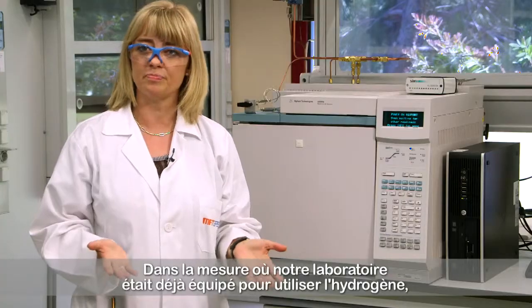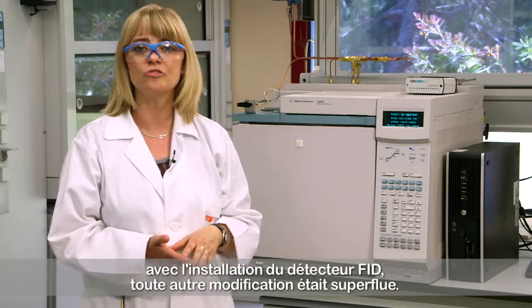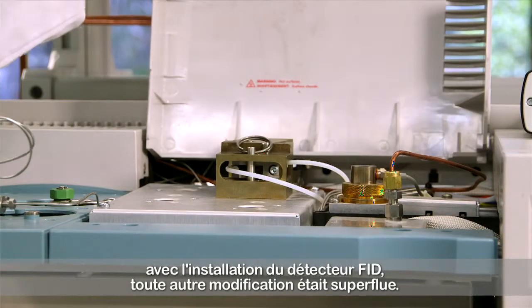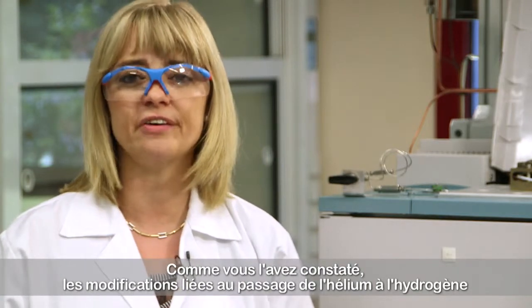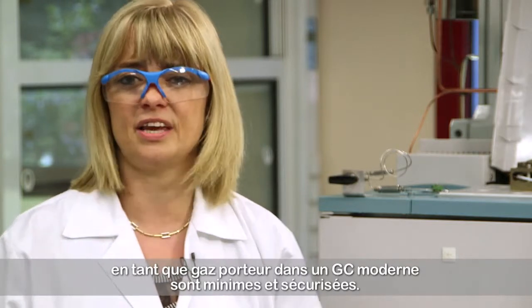As our lab was already prepared for work using hydrogen with the supply of the FID detector, no further modifications were required. As you saw, the modifications to move from helium to hydrogen as a carrier gas in a modern GC are minimal and safe.